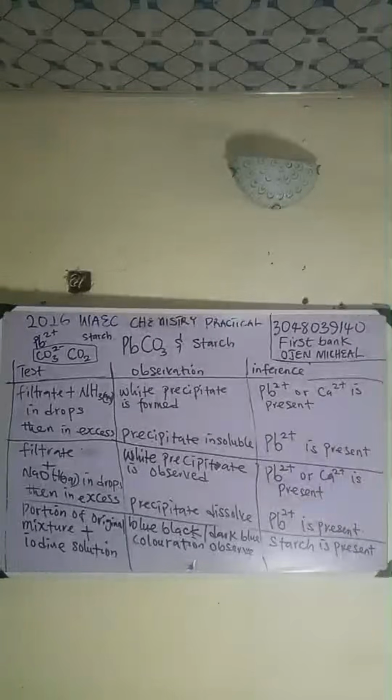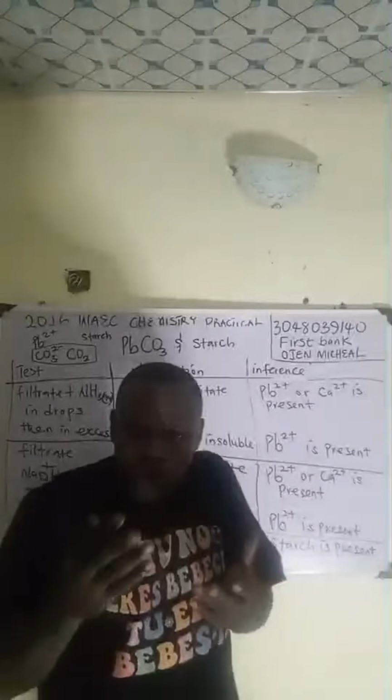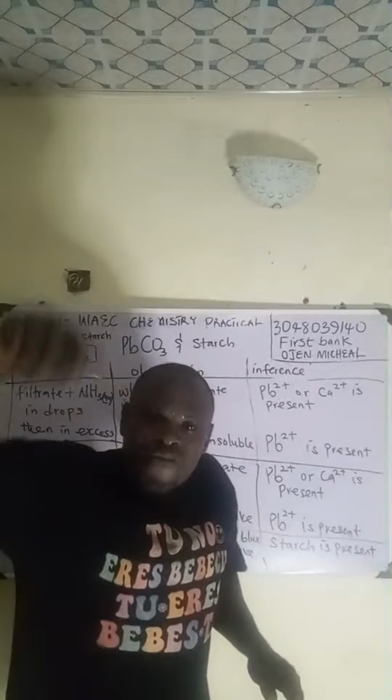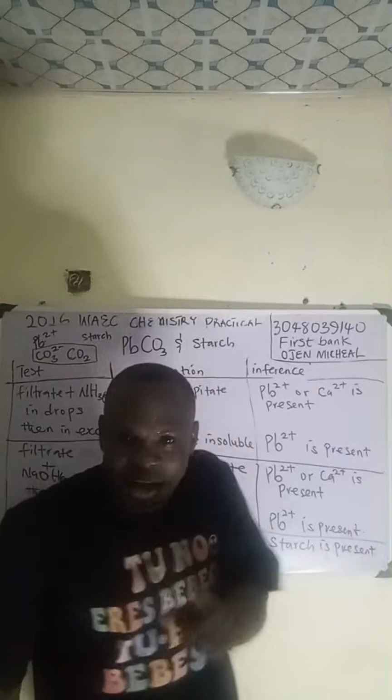Confirmatory test for lead. Okay. Since you asked, I told you that in the reagents given, the instruction material they gave to teachers, there is no confirmatory reagent. But what you can use to confirm lead is potassium iodide.